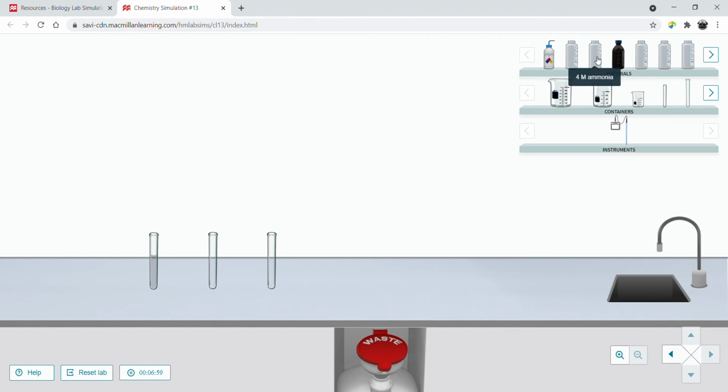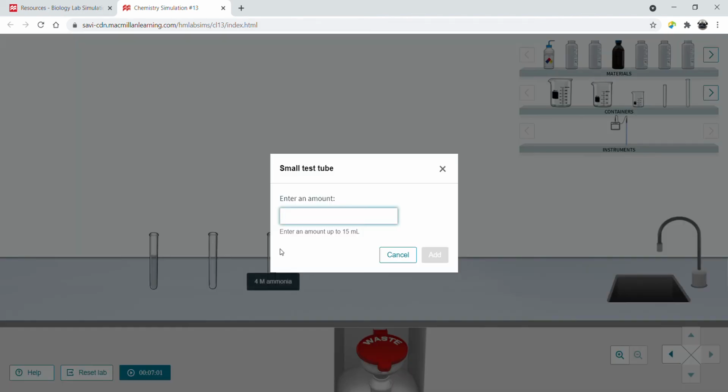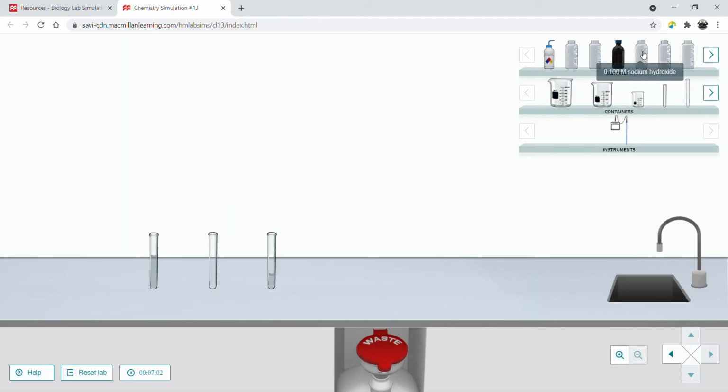Okay. Now we don't want acetone. Ammonia actually goes into the third one, so we'll do ammonia. And where is our vinegar? Did I pass it? Hold on. Water, acetone, ammonia. Maybe it's in the brown bottle? Why would it be? No, that's hydrochloric acid, sodium hydroxide, sodium dihydrogen, sodium, we're going to need that for later, citric acid, diluted bleach. Where is it? Oh no, there it is. Okay, vinegar goes into number 2.